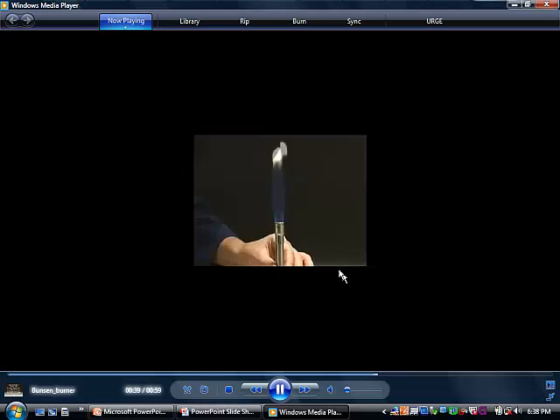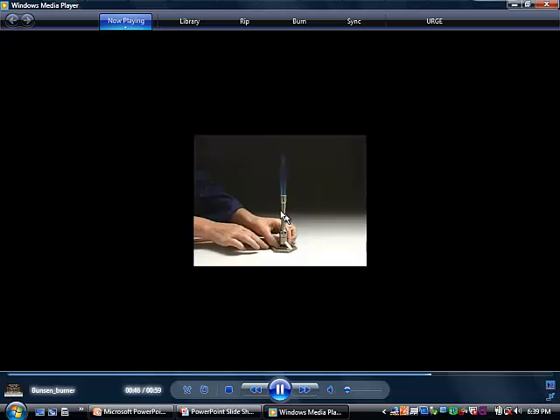You then control the flame by letting more or less oxygen in. We're letting more oxygen as we're spinning in this direction. Notice the flame now is starting to have that cone there, which means it's hotter.